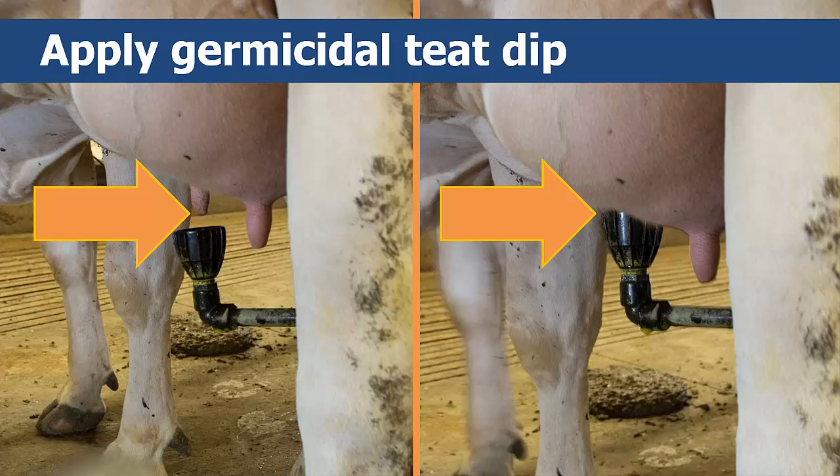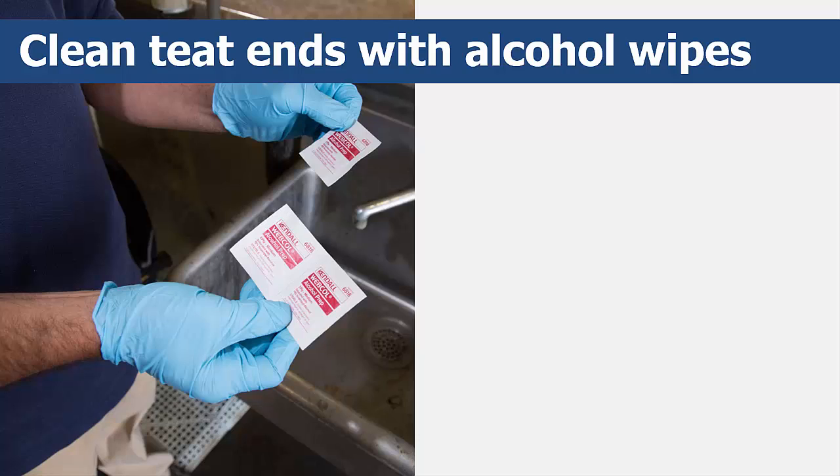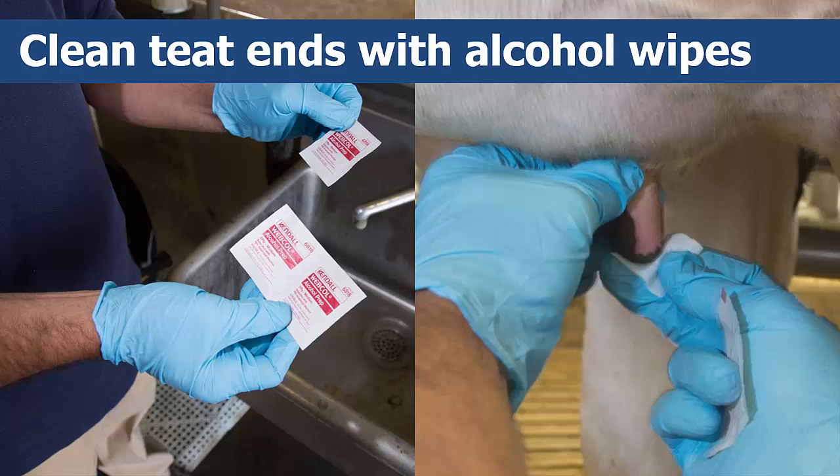Then dry the teats thoroughly using a clean cloth or paper towel. After dipping and drying, you should then vigorously scrub the teat, paying close attention to the teat ends using cotton balls soaked in 70% alcohol. Squeeze out any excess alcohol before using them on the cow, or use alcohol pads, until the cotton balls or pads remain clean. Use as many cotton balls or pads as you need. Take care not to touch the teat end with your fingers and don't let the teat end touch the cow's leg, another teat, or her tail.